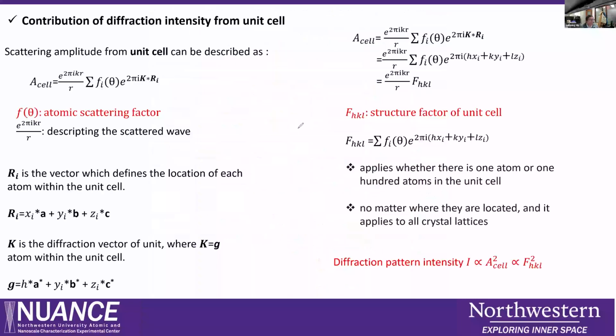Okay, so next, let's move on. I would like to show you the contribution of the diffraction intensity from a unit cell. For any solid material, I mean crystal, they have a unit cell, and the scattering amplitude can be described using this expression.